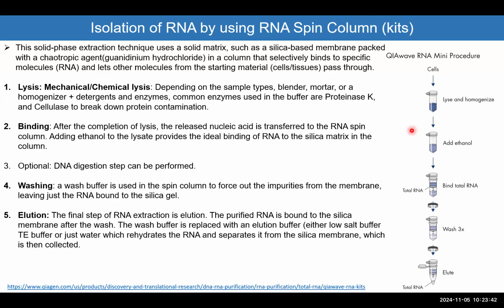The process is practically the same. You will first lyse, whatever lysis method you are using, blending or homogenizer or detergent or enzymes. You combine that with proteinase K and cellulase in case you are using bacteria or plants. And then you will get a homogenate.